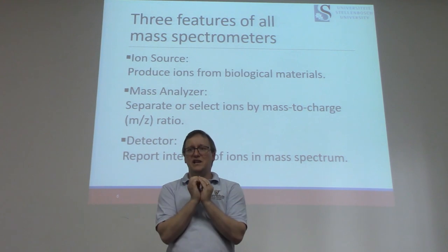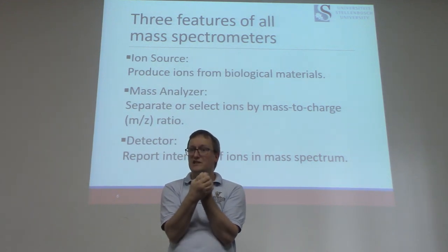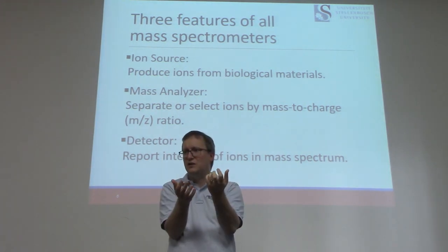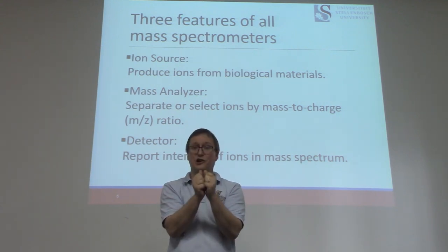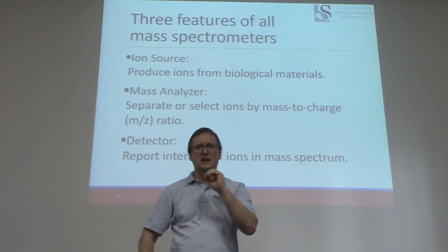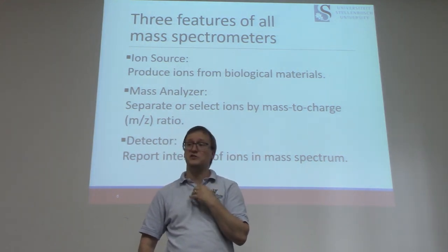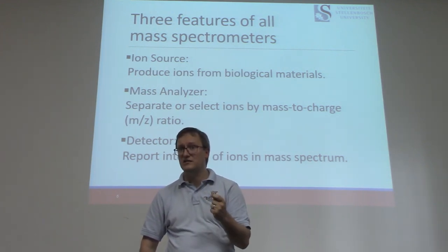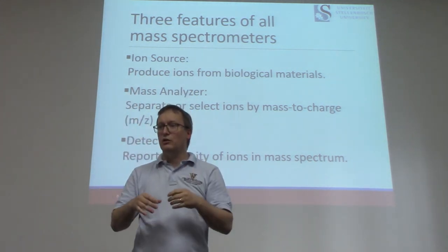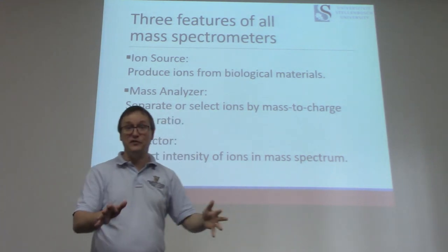All right, now mass analysis is probably the biggest black box in the field on this one. Dealing with the ability to separate out all of the ions that are present in the cloud of ions in the mass spec at any given moment in time is a process of mass analysis. So the instrument is going to separate all these different things that might possibly be in the instrument based on their mass to charge ratio. Now, if I say M over Z, that's because I'm being an American, it's M over Z, I suppose. So that is the mass in Daltons of this thing divided by the charge that it is carrying. In proteomics, it's almost always the case that we're talking about protonated ions, thus positively charged ions. So those get separated and sometimes isolated by or modified by what charge state they're carrying and their mass. So mass to charge ratio determines everything about this stage.